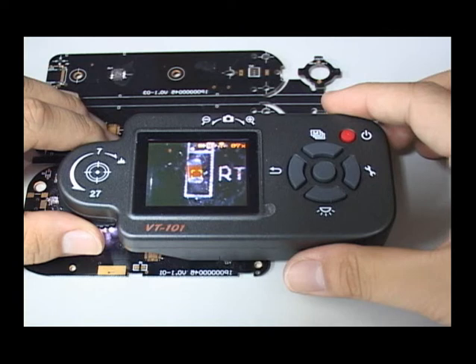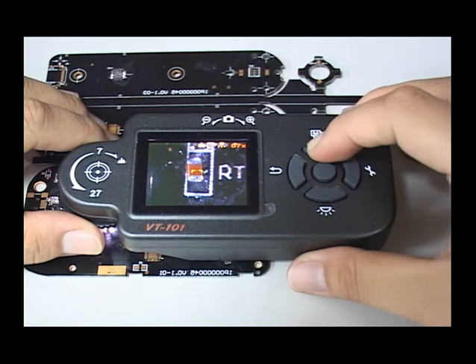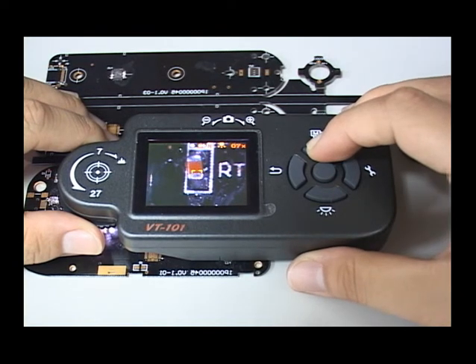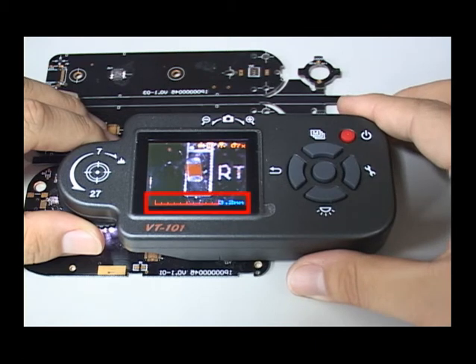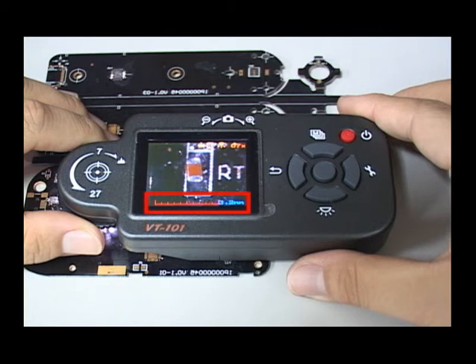Press the top button for 2 seconds until the ruler shows up. The ruler has 10 sections and its unit is shown at the right end — the unit shows the total length. To calculate each section, divide the unit by 10. For example, if the unit is 2.8 mm, then each section is 0.28 mm.